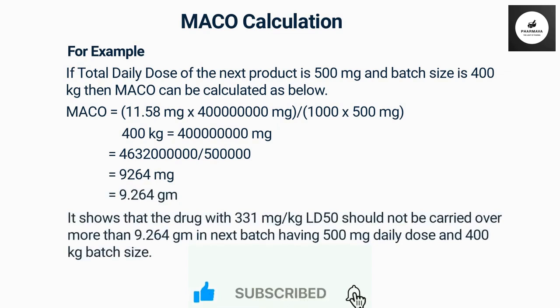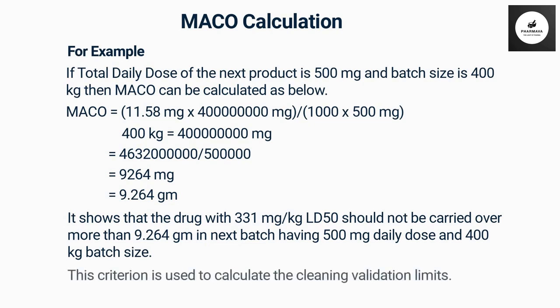It shows that the drug with 331 mg per kilogram LD50 should not be carried over more than 9.264 grams in the next batch having 500 mg daily dose and 400 kg batch size. This criterion is used to calculate the cleaning validation limits.